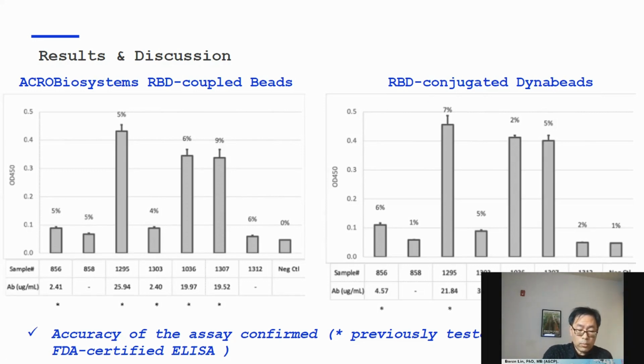We then ran the protocol to process the serum samples to measure COVID neutralizing antibody. The assay was able to confirm positive samples and quantify the level of the target. The results have again demonstrated consistency of sample processing on the liquid handler.